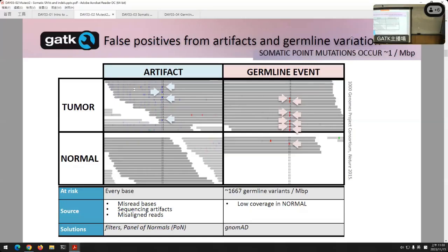All right. And by the way, that happens sometimes if there's limited funding and people want to focus their sequencing. They'll focus a lot of it on getting really high depth on the somatic cells and maybe a relatively low pass on the normal. But it does introduce this class of error where you don't have enough depth to be able to call it in the normal cells, but you can on the somatic cells, and then you can make the mistake of assuming it's only there in the somatic cells if you're not careful.